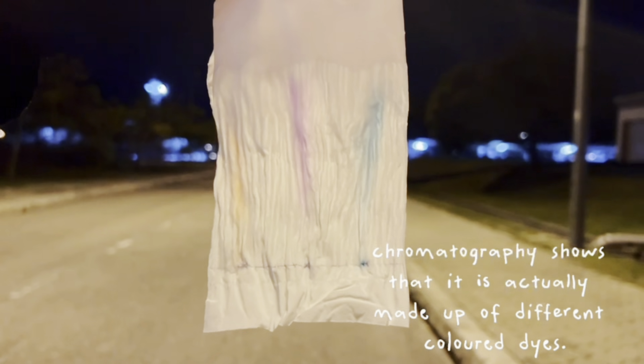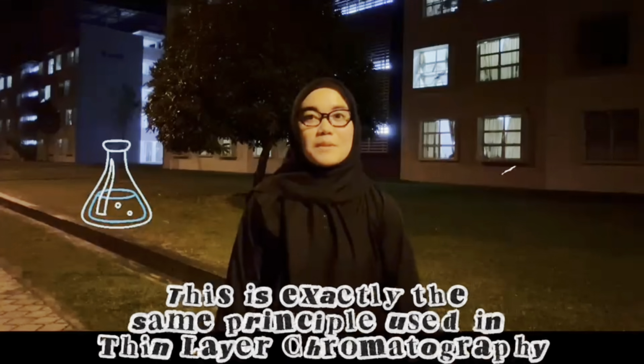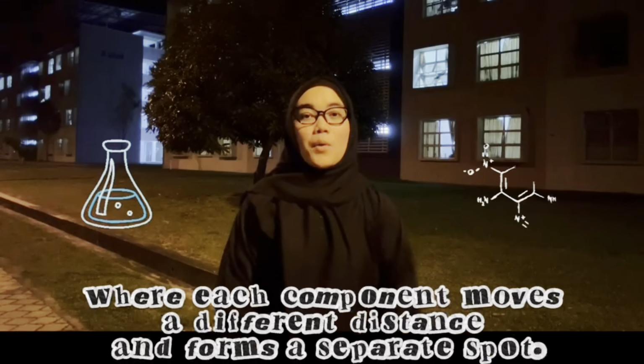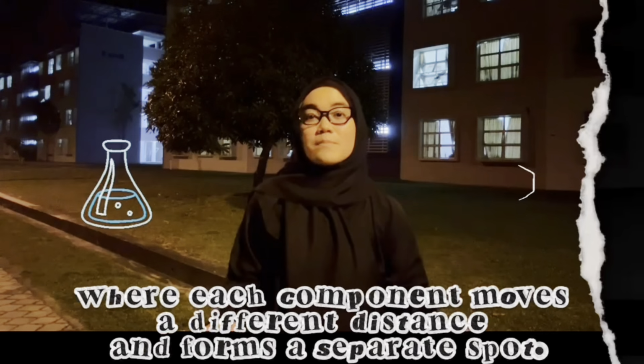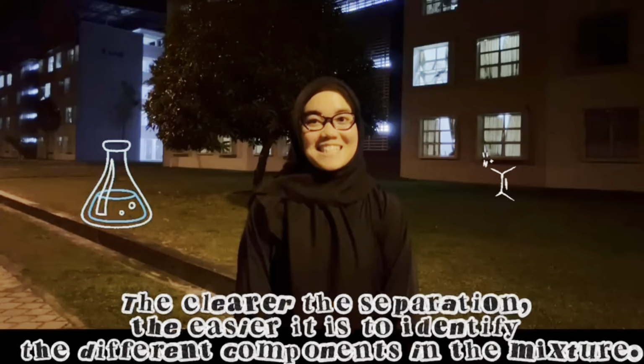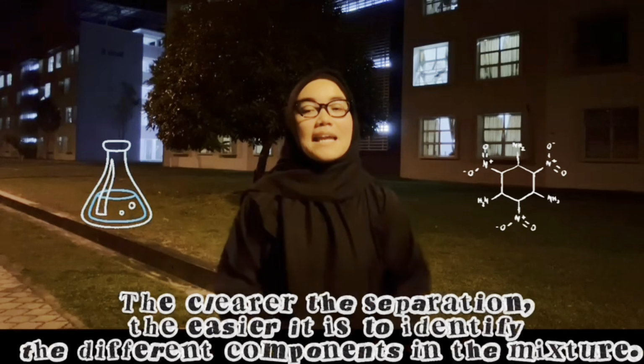Even though the marker looks like one color, chromatography shows that it is actually made up of different colored dyes. This is exactly the same principle used in thin layer chromatography, where each component moves a different distance and forms a separate spot. The clearer the separation, the easier it is to identify the different components in the mixture.